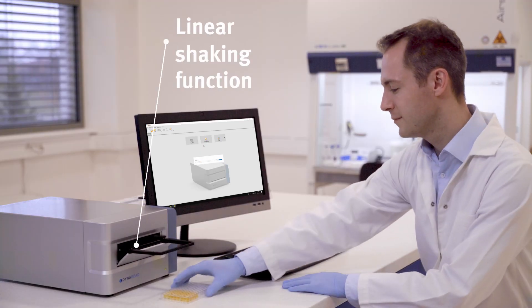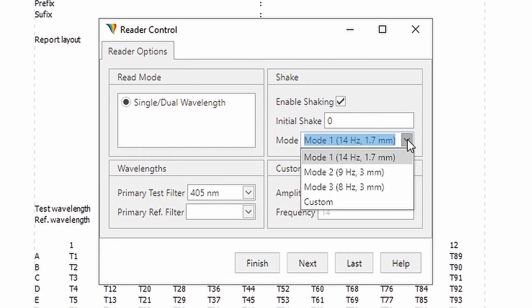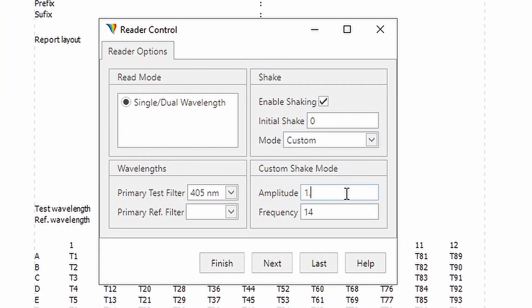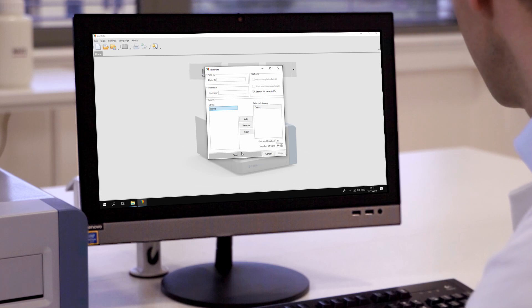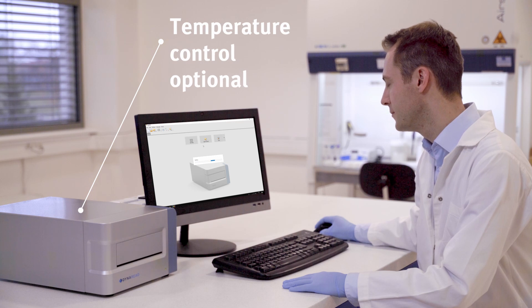The reader is equipped with a shaking function to conform to all requirements of your assay protocols. Optionally, there is a version including temperature control to allow you kinetic measurements requiring incubation stages.